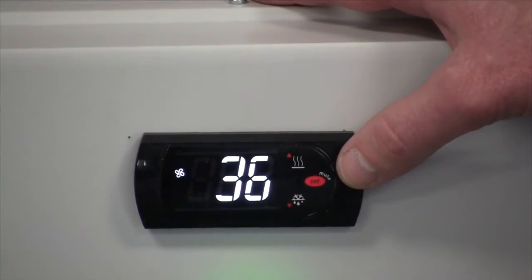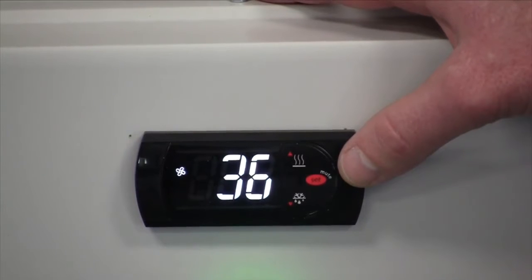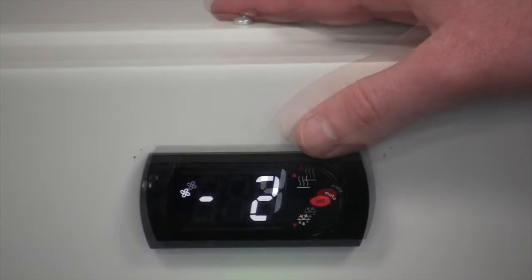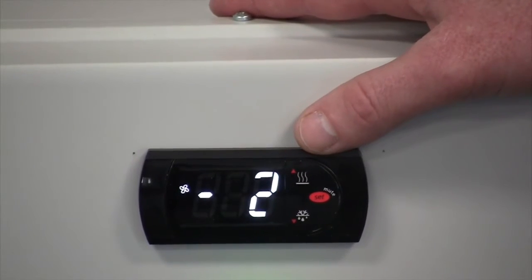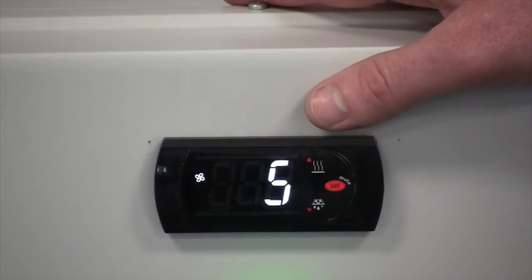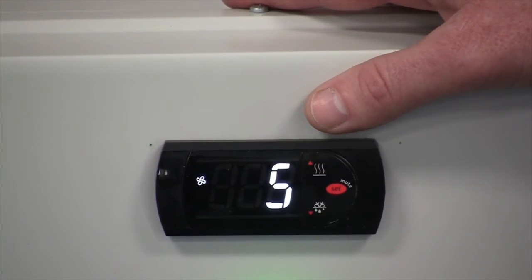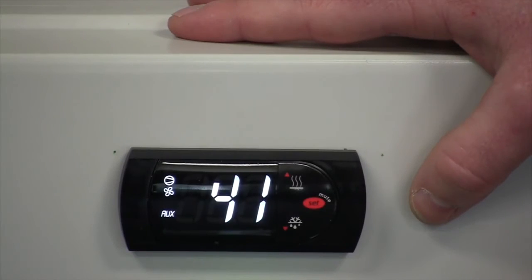The factory preset for refrigerators is 36 degrees F with a positive 4 degree differential. The factory preset for freezers is minus 2 with a positive 5 degree differential. The set point is a cutout temperature. Now we'll show you how to change the set point.